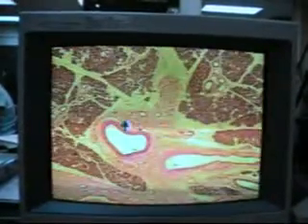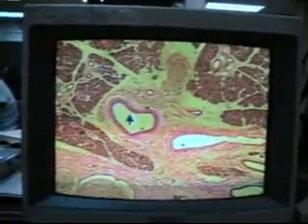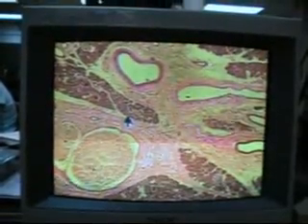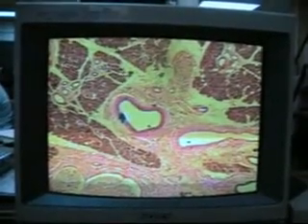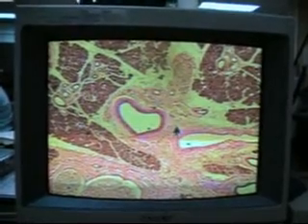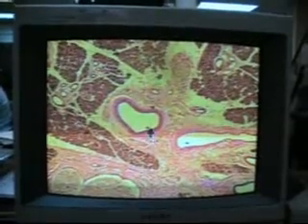So that is the tunica adventitia, tunica media, and tunica intima. You can tell a large artery from a large vein by looking primarily at the lumen. Now let's look at a smaller one, to get a sense of what it looks like. I do apologize for the way this looks on the scope, but you can still look at it. This is going to be a small artery, and you can see that because here's the corresponding vein that would go with it, and just the size of the lumen would give that away.